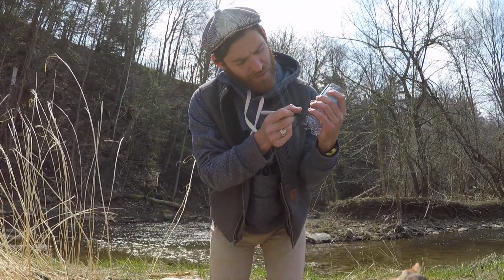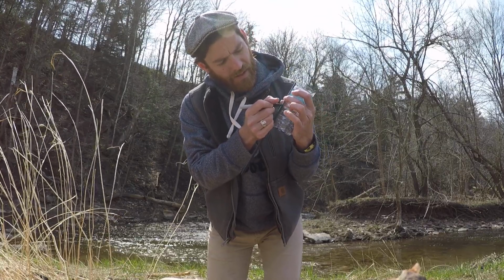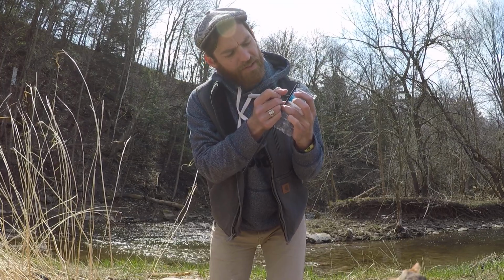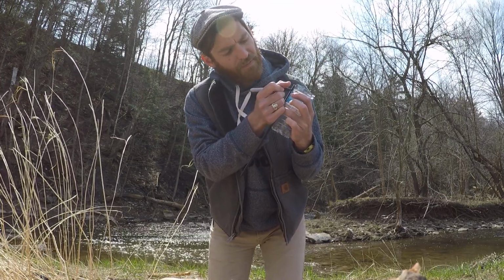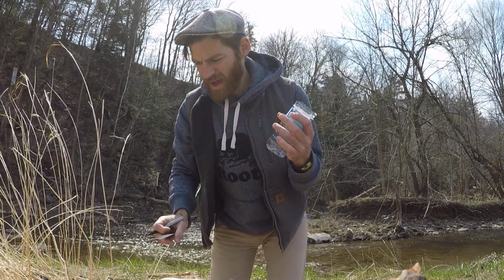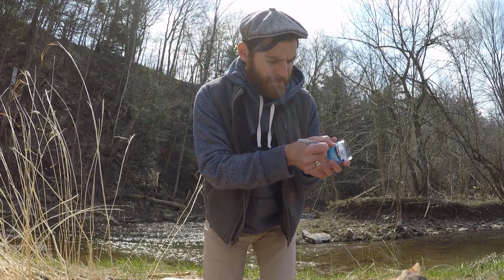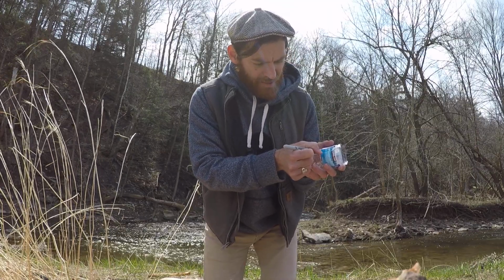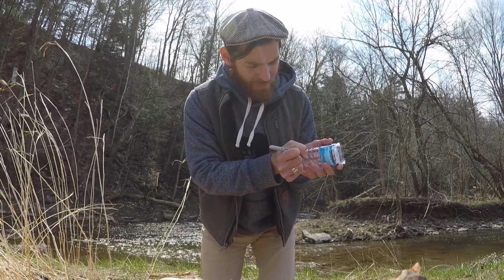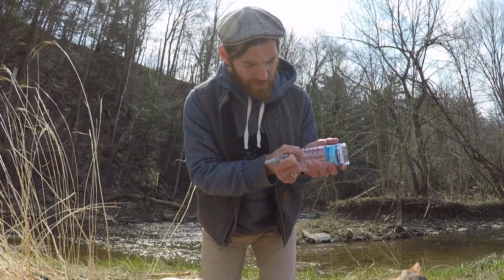Okay, so there's 12, 11, 10, 9, 8. You can also just fill the thing up and then measure it afterwards. But if you want to have your turbidity meter and keep it forever, this way it can be a standalone. So 1, 2, 3, 4, 5, 6, 7, 8, 9, 10, 11, 12, 13, 14. Okay, great.